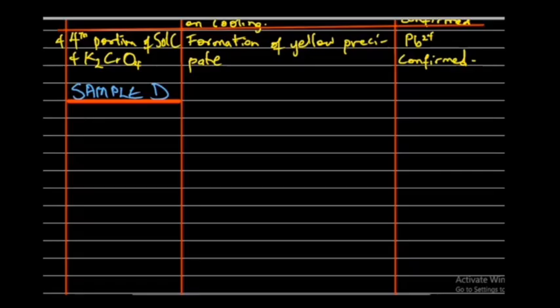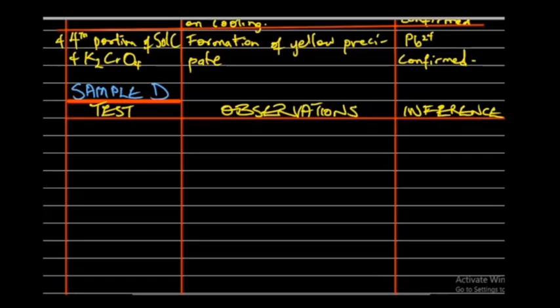So talking about sample D now, our first test: sample D, put in 5 ml of distilled water.